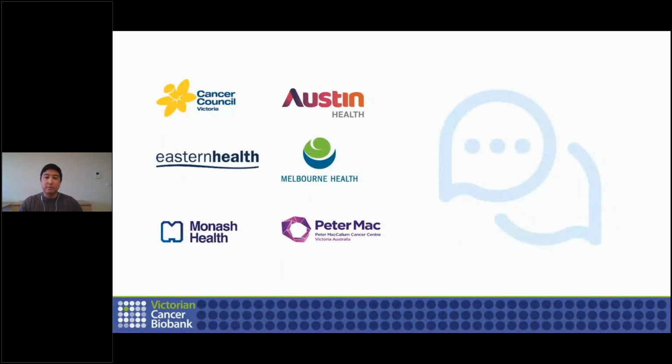Again, Camille has a question on what features would you want to see in future versions of OpenSpecimen? What's your wish list? That is a good question. In terms of the querying functionality, I guess it would really help to be improved, a bit more helpful for business analytics on a regular basis. I know we can schedule these queries, but it's really the business analytics that would help, so we wouldn't have to externally export the data and then manipulate it. We would be able to powerfully do that within OpenSpecimen.